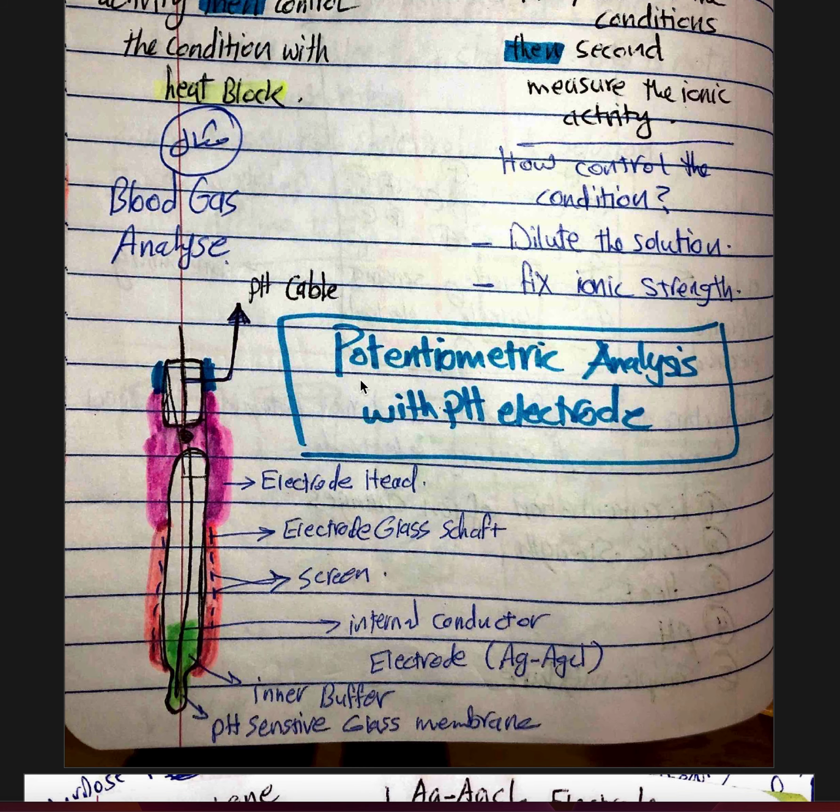Then we talk about potentiometric analysis using the pH electrode.